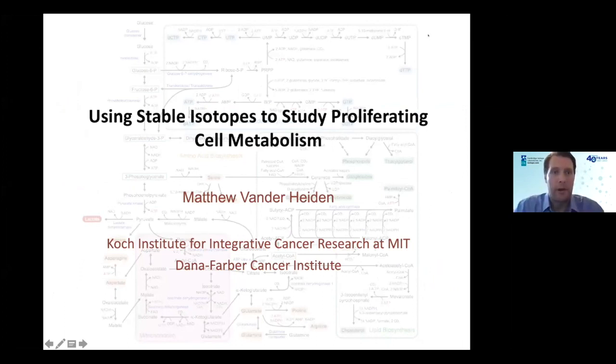Sure thing, Krista. The choice of label is very important in the standard selection process. We have preferenced 13C and 15N over D because of its high chemical and isotopic stability. That stability ensures that the label's location is retained. In addition to that, it allows a coelution chromatographically with its unlabeled analog. So with those merits combined, this should provide broad flexibility for end use in both method and application.